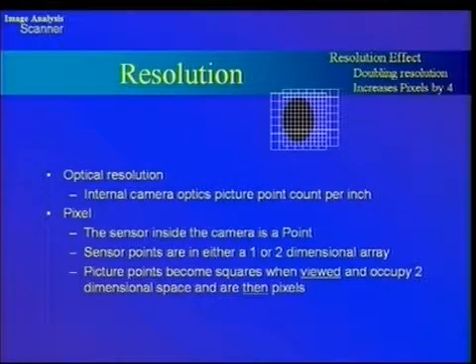Resolution is very important. Most of our specs are very small. We're looking at specs of 0.01 square millimeters. To acquire the image of such a small speck, you require a resolution of at least 600 ppi. Moving to higher resolution of 1200 and 2400 ppi, we increase our ability and our accuracy of the measurement considerably. In production, though, we found that 600 ppi is adequate.